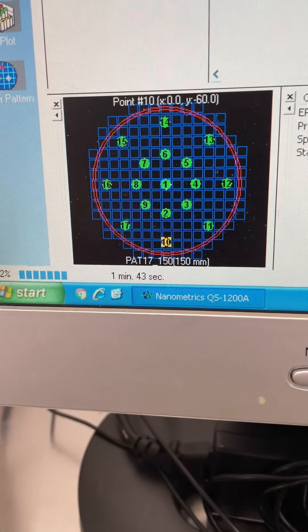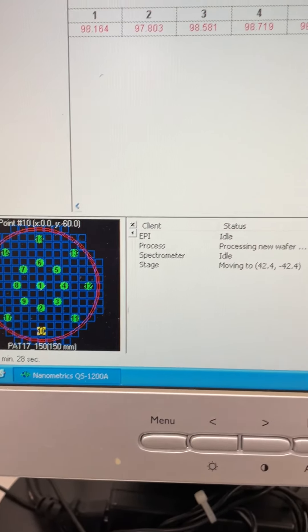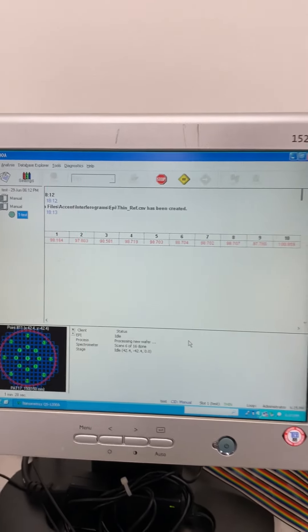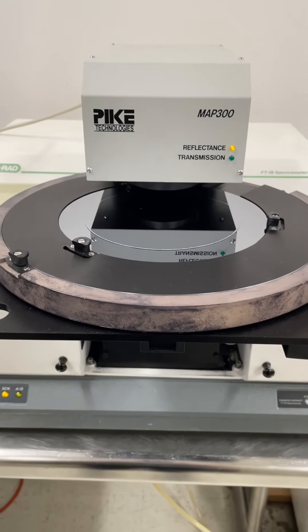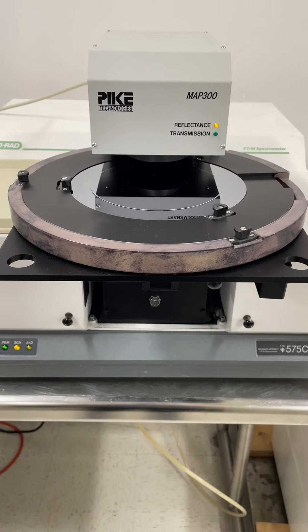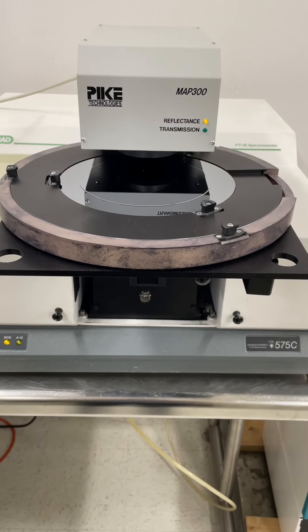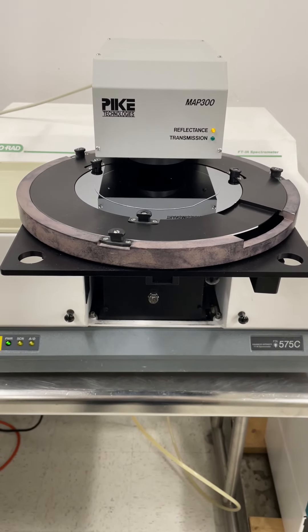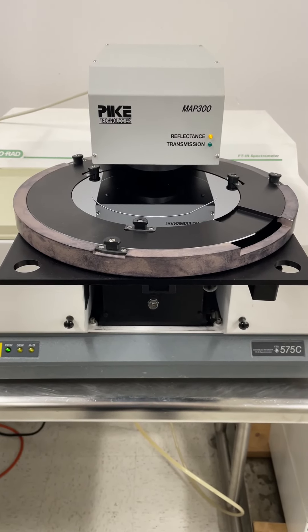It's on point 10, measuring 100 microns. After this, we will run 20 times at the center point of the wafer for a repeatability test.